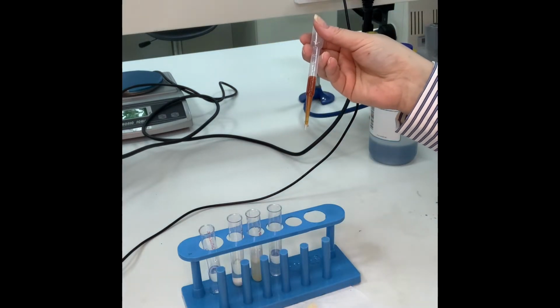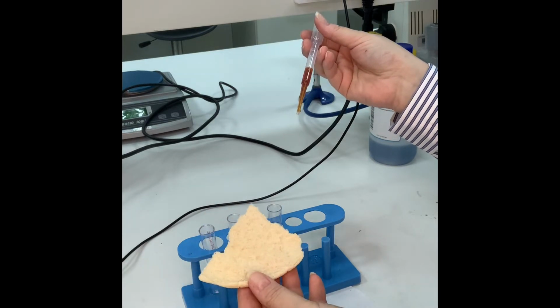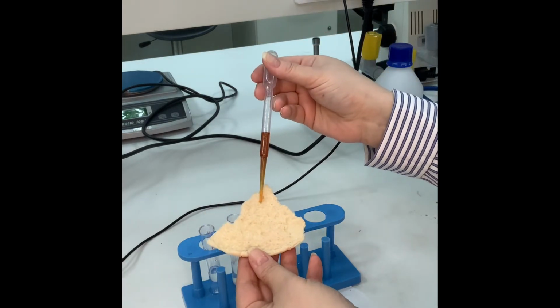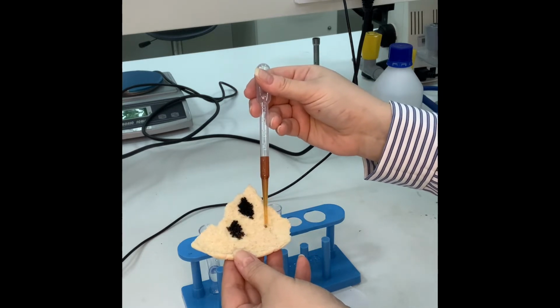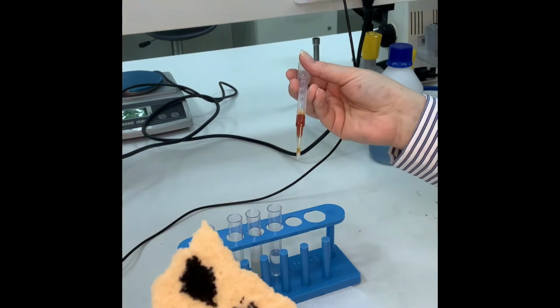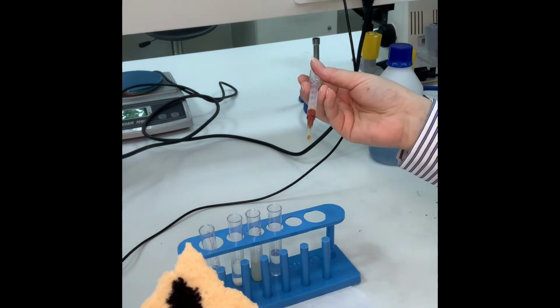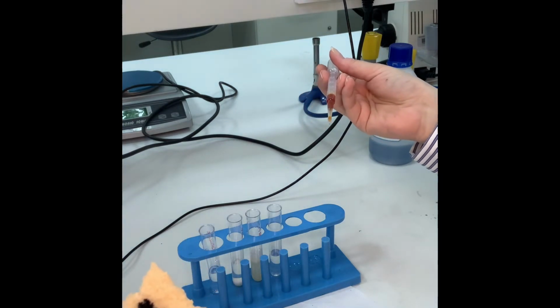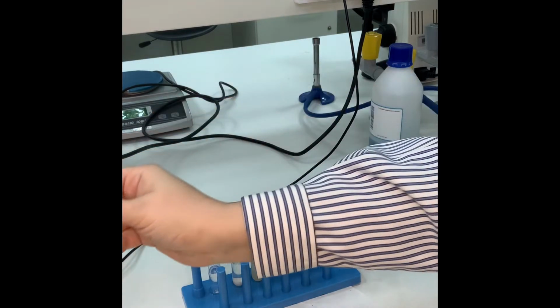When we add it to any substance or liquid that contains starch, it will change into a black blue coloration. Look at that. So why do we call it black blue? Because when you look at it, it is light black, so we call it black blue, or you just refer to it as a black coloration.